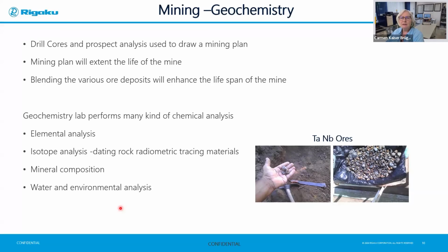So very often the geochemistry laboratory and mining together, they drill the cores and they do prospect analysis to draw up the mining plan. In order to draw up the mining plan, it's very crucial because they need to make sure that they have a proper usage of their life of mine. Otherwise, they deplete the good quality mineral, and they need to blend, of course, the various deposits to enhance and make sure the lifespan of the mine is correct.